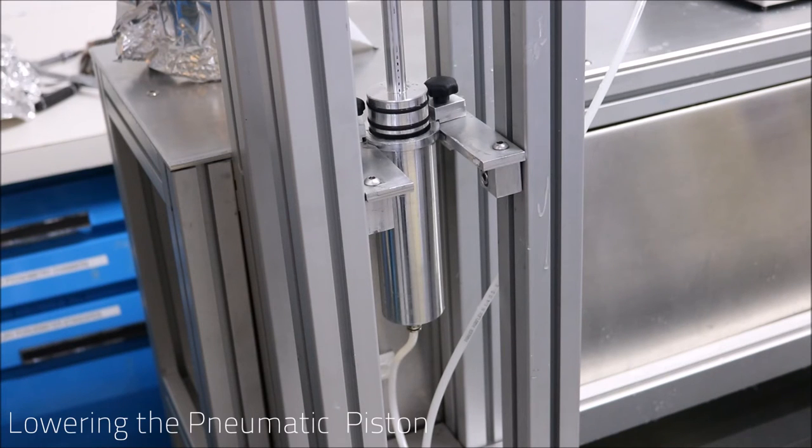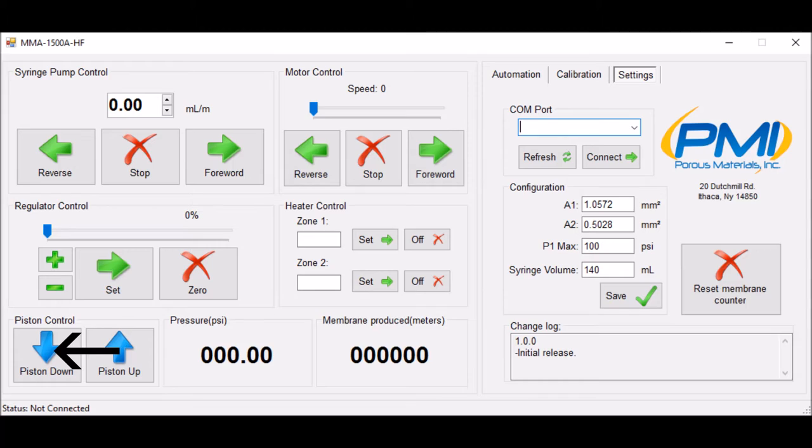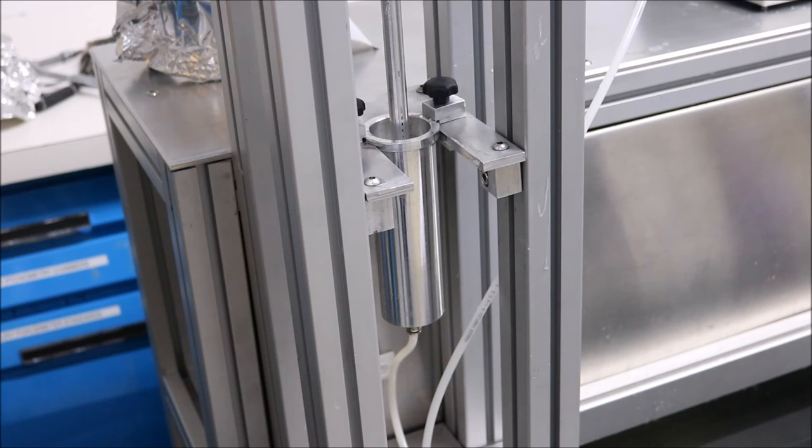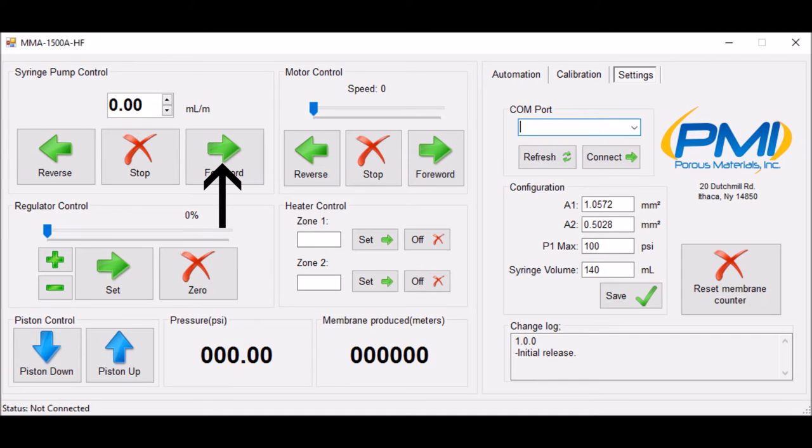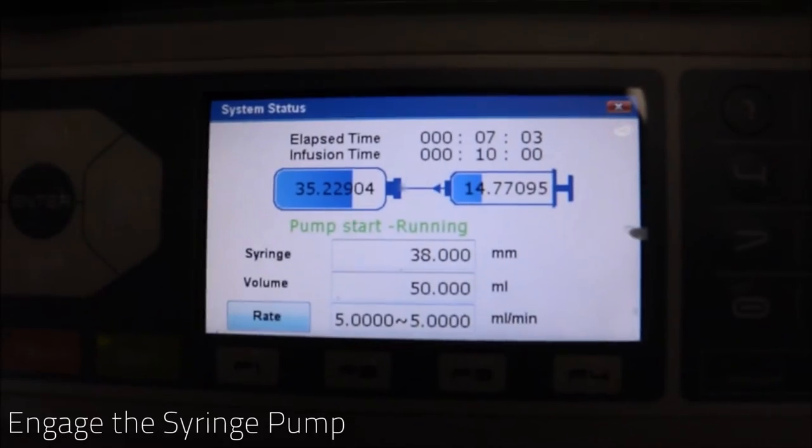Now we must engage the pneumatic piston, and then the syringe pump. Simply use the manual control panel to select the down arrow to begin moving the pneumatic piston down. Then we will tell the syringe pump piston to begin moving forward.